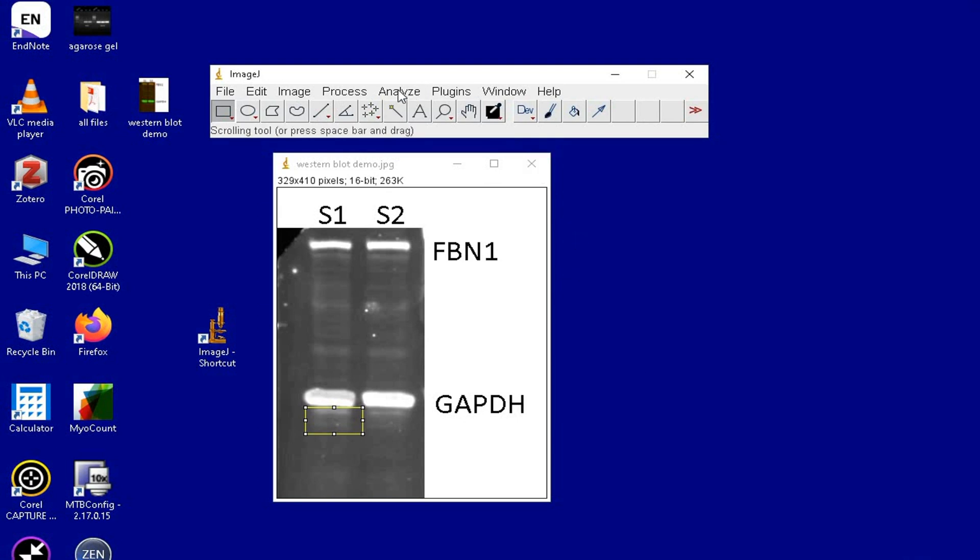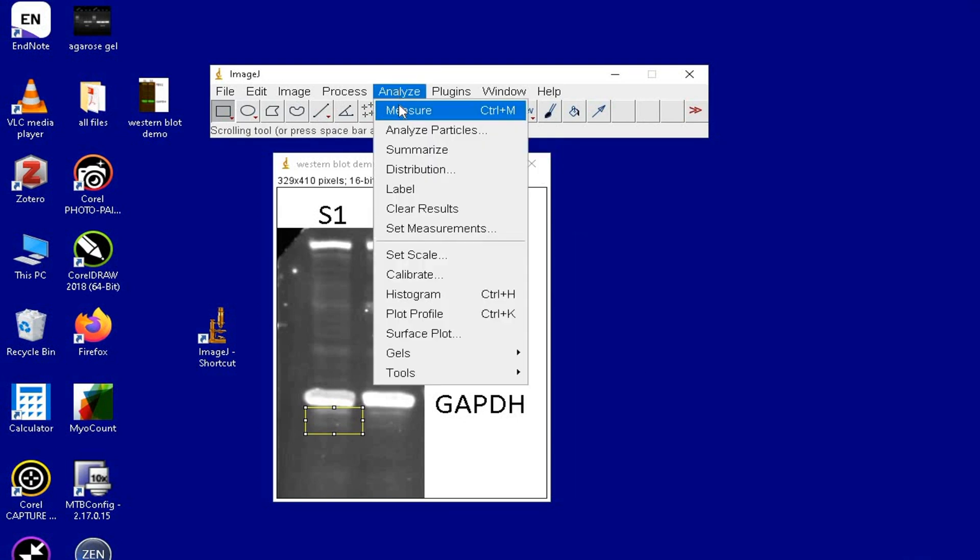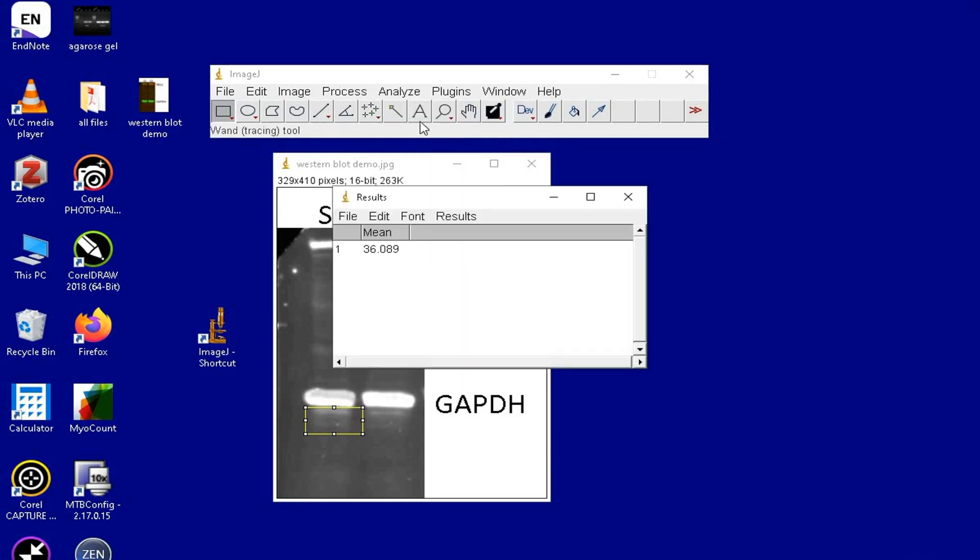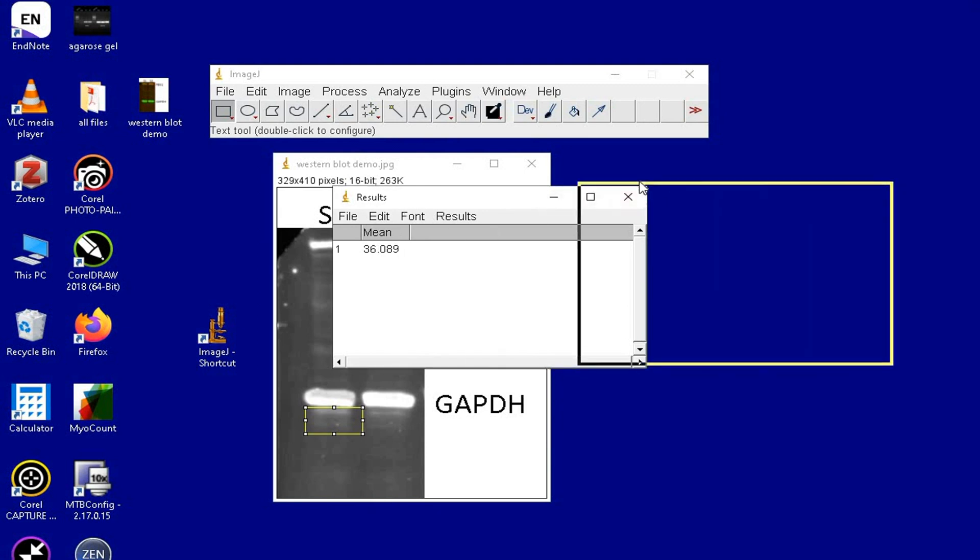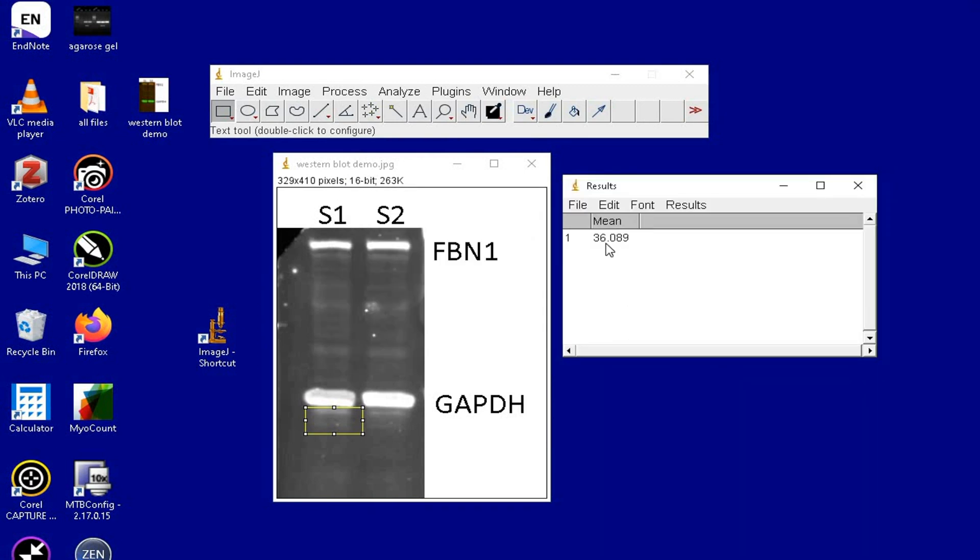Again, click on Analyze and then Measure. The dialog box shows the mean gray value of the background or the noise to be 36.089.